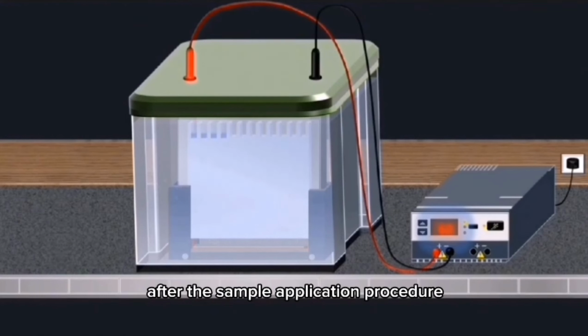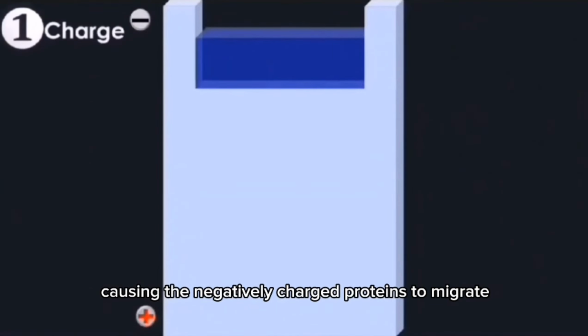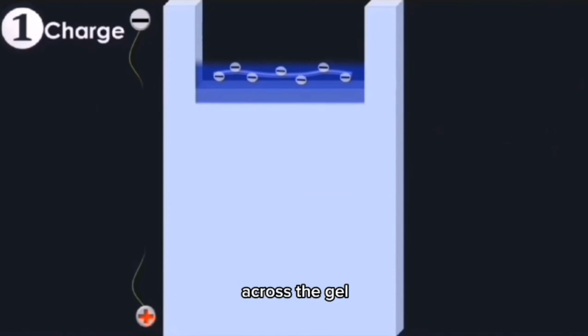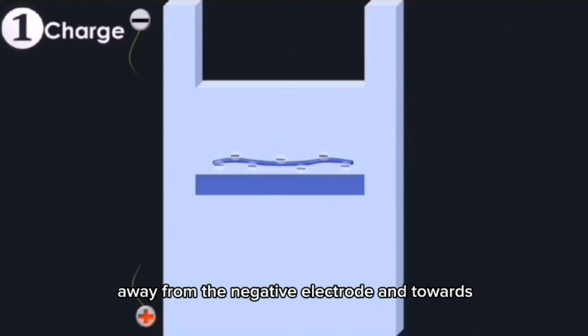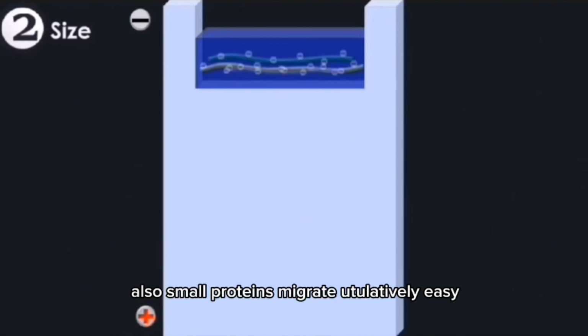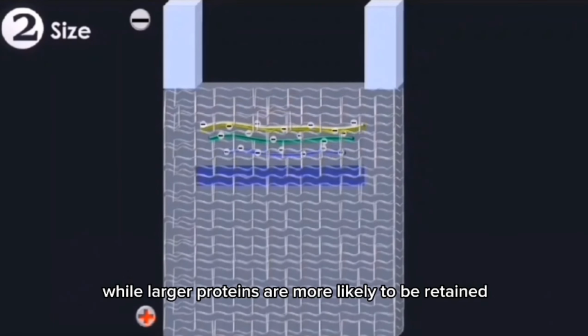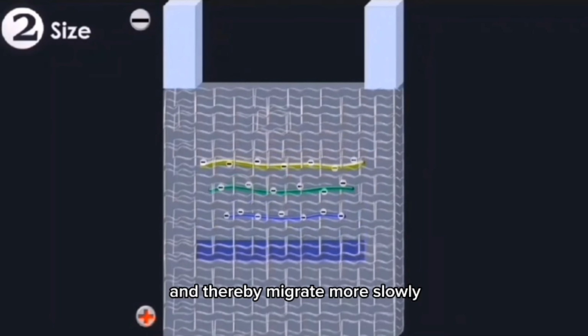After the sample application procedure, an electric field is applied across the gel, causing the negatively charged proteins to migrate across the gel, away from the negative electrode and towards the positive electrode. Also, small proteins migrate relatively easily through the mesh of the gel, while larger proteins are more likely to be retained and thereby migrate more slowly.